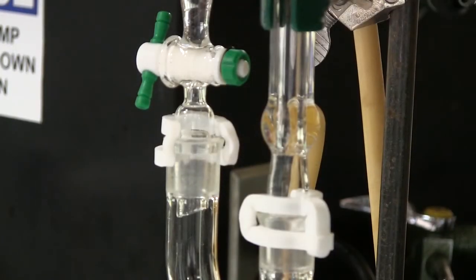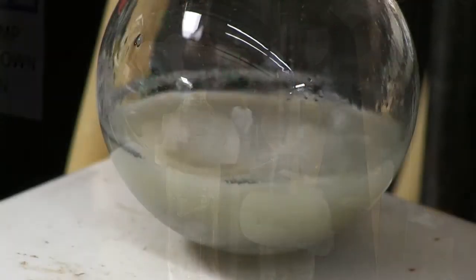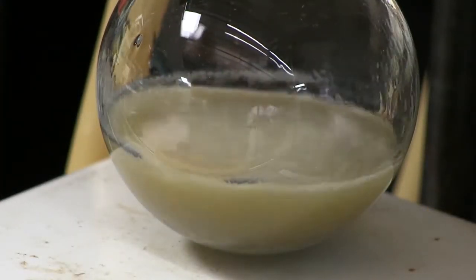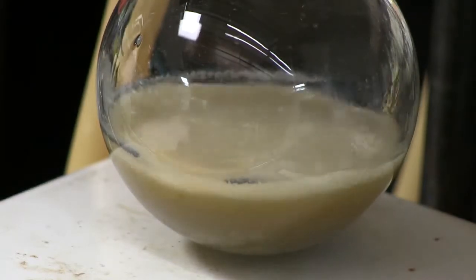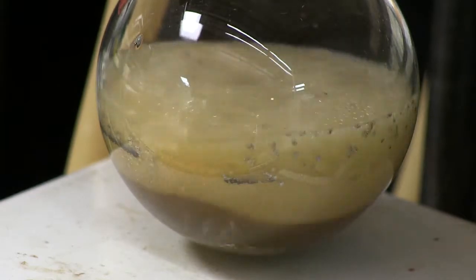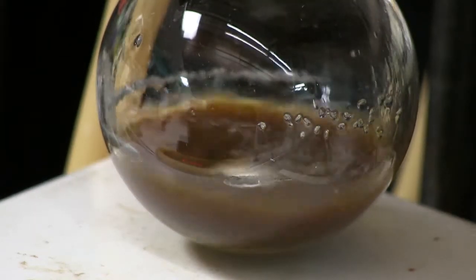Open the stopcock so that the bromobenzene solution is being added dropwise. If the solution appears to be boiling too vigorously, slow or stop the addition until the reflux is more controlled. Complete addition should take about 5 minutes. Continue gently heating for 30 minutes after the last of the bromobenzene has been added. Your solution should be chalky with a brown to greenish color.